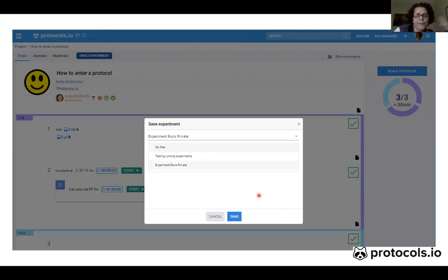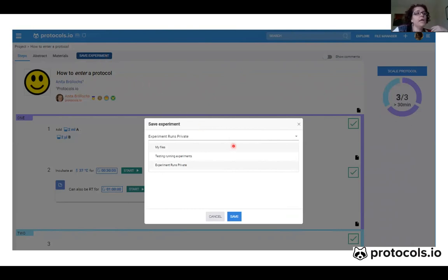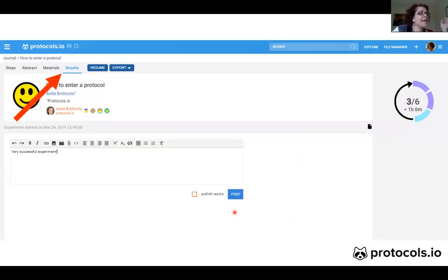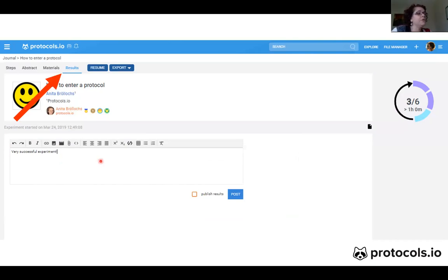After you run a protocol, if you want to remember when you did the experiment and what the result was, you can click Save Experiment. Protocols will ask you where you want to save this run, and then you choose and click Save. After saving, you can go to Results and write a note about what the result was, and everybody in the group can see what was the result of that experiment.